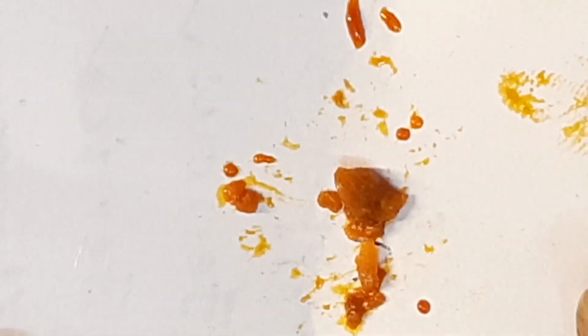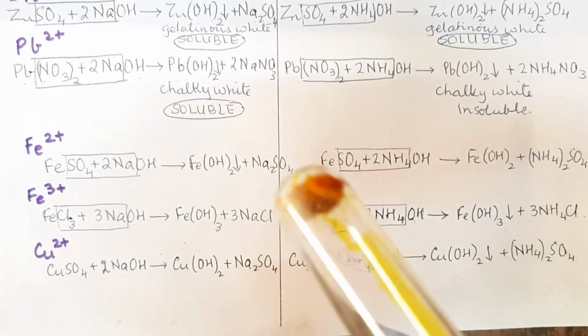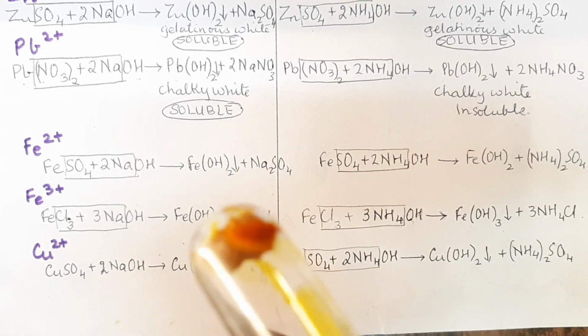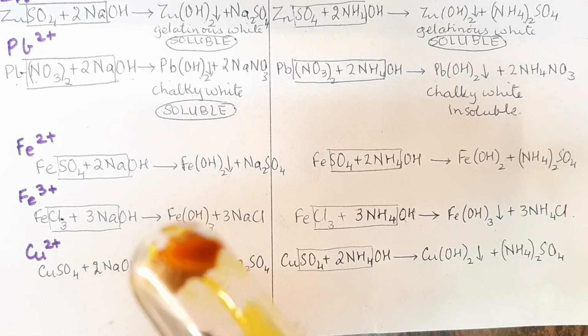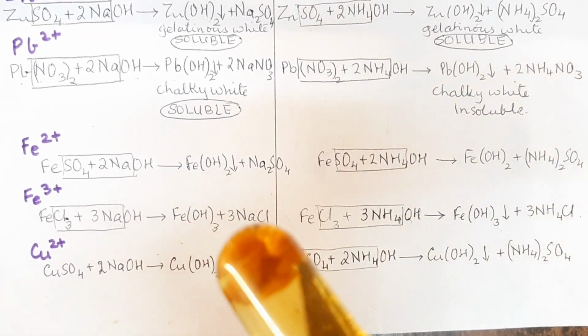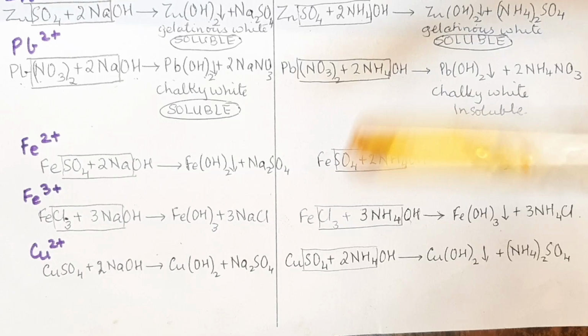You can see it has already stuck to the paper. It has already dissolved. Now I'm adding a little water to that ferric chloride, and so we will get a yellowish brown liquid.